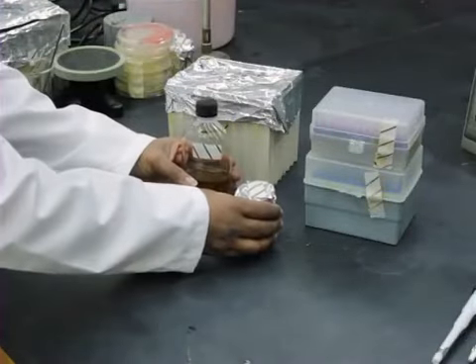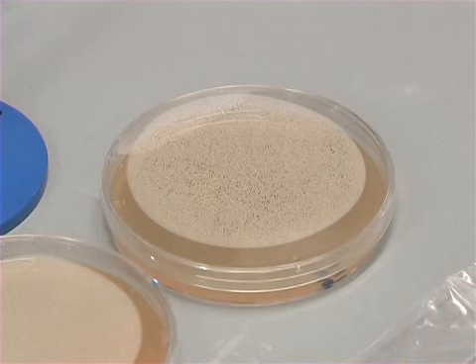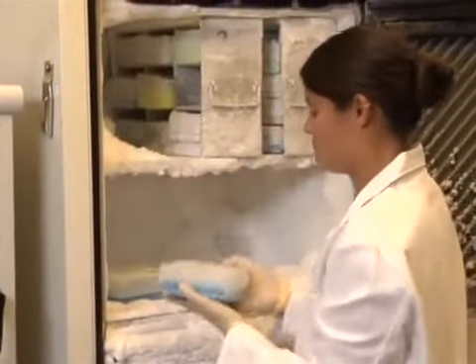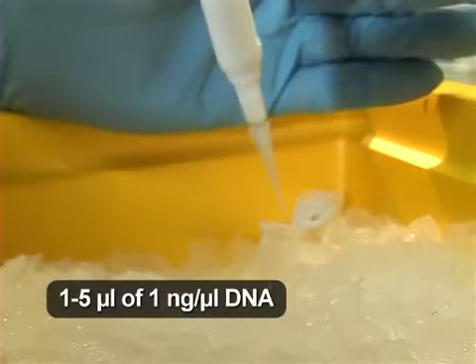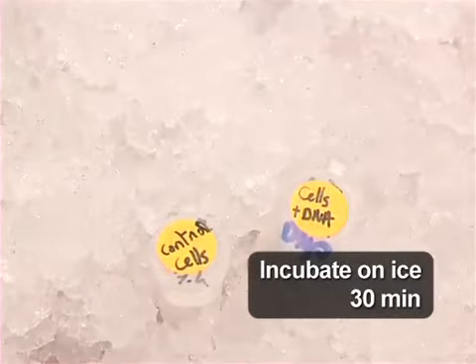Immediately before the heat shock reaction, pre-warm your media to room temperature and antibiotic-containing LB agar plates to 37 degrees Celsius. Also make sure that your water bath is at 42 degrees Celsius. Next, thaw your chemically competent cells on ice. Add 1 to 5 microliters of 1 nanogram per microliter cold plasmid to the bacterial cells, mix gently, and return the cell and plasmid mixture to ice for 30 minutes.